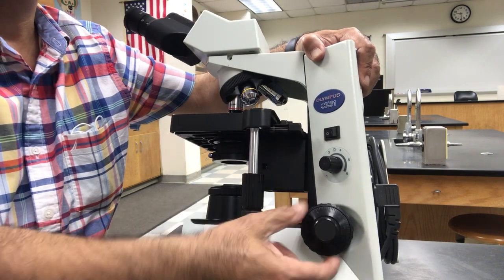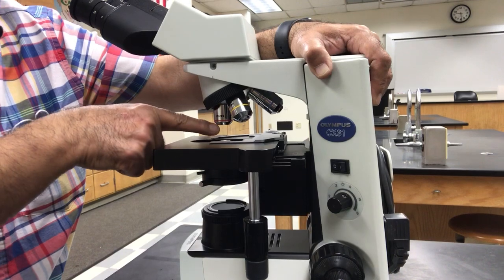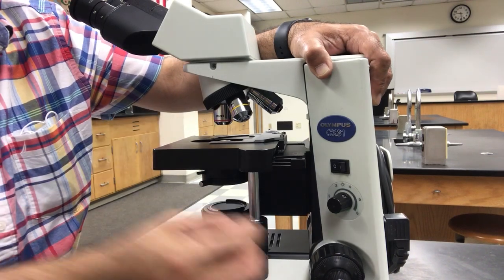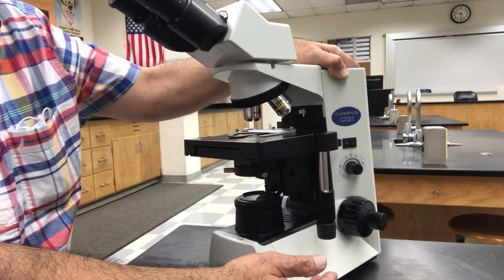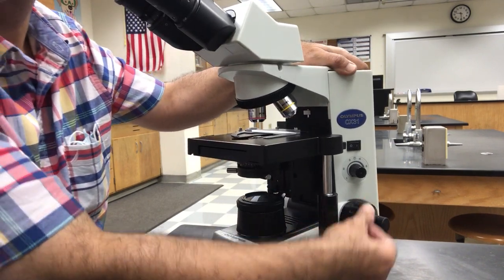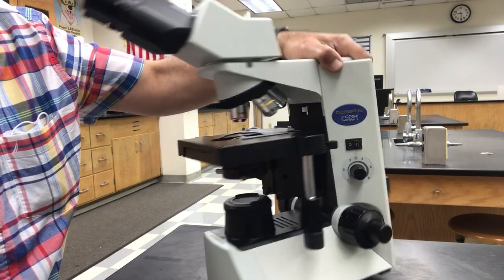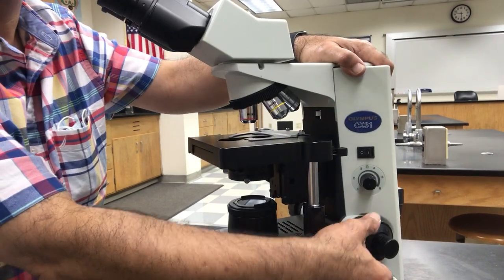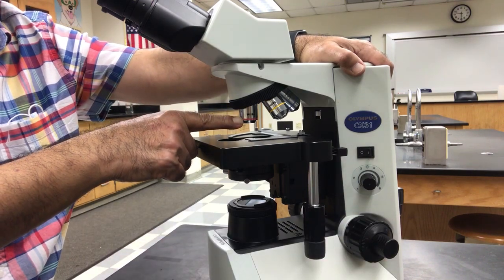The big knob is the coarse focus knob, only to be used with the scanning objective lens. And the smaller of the two, if you can see now, this is the fine focus knob. So the coarse focus knob you use with the scanning objective lens.